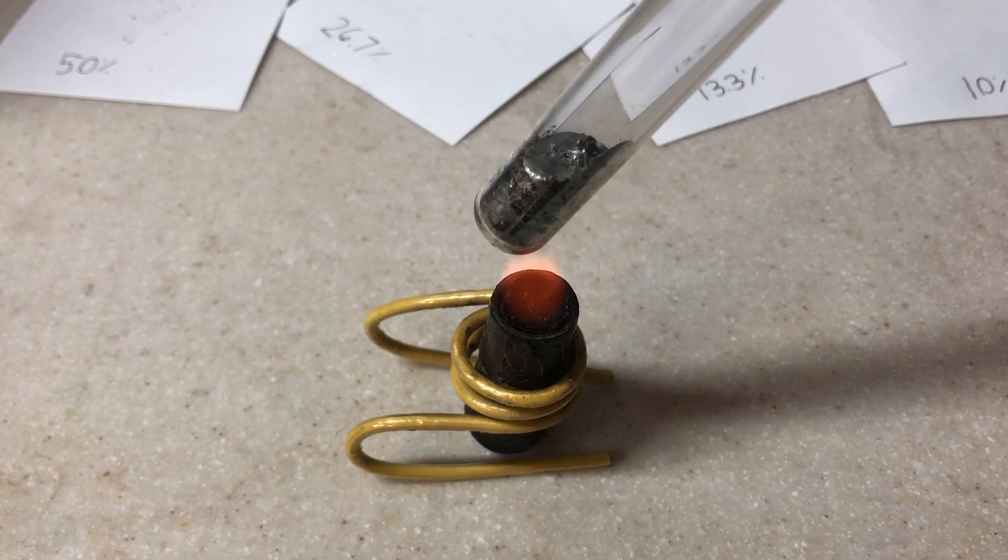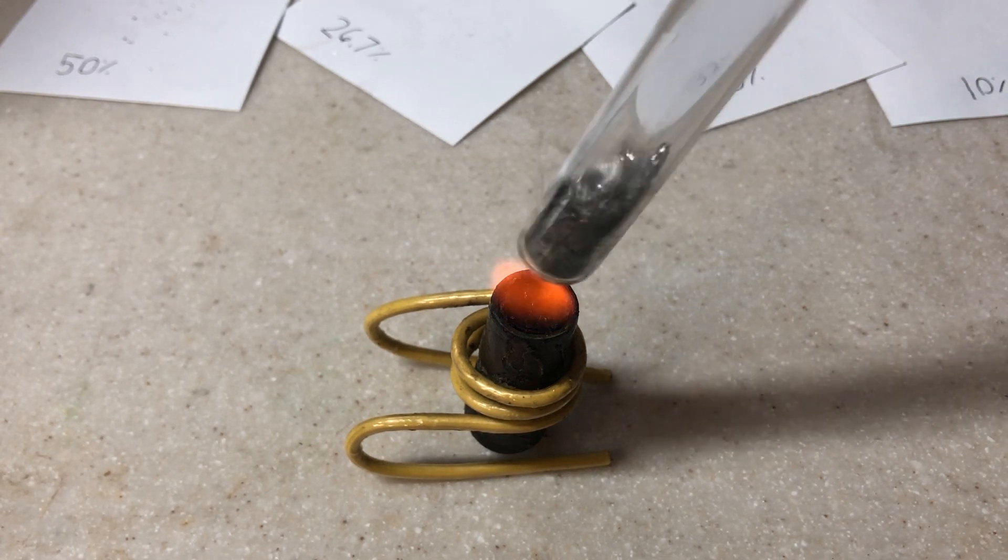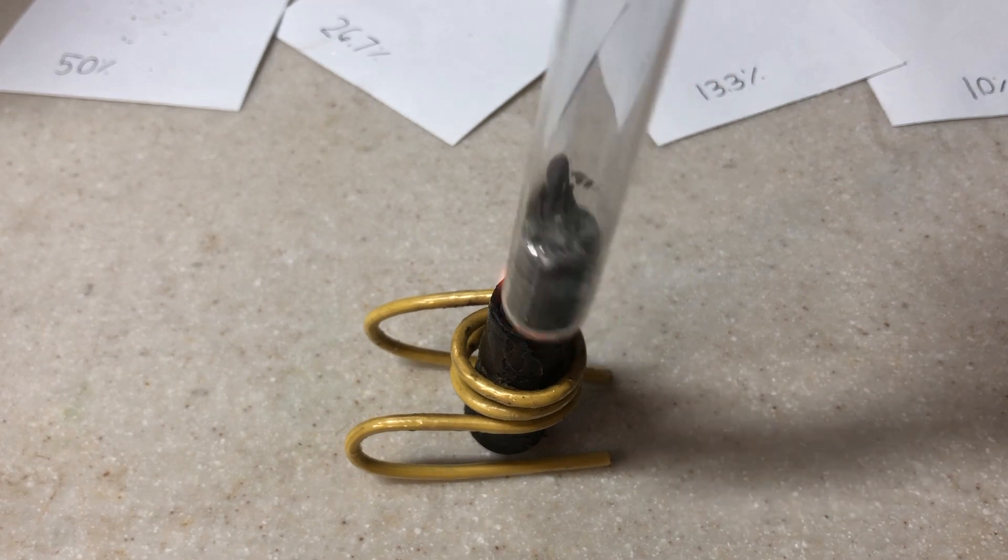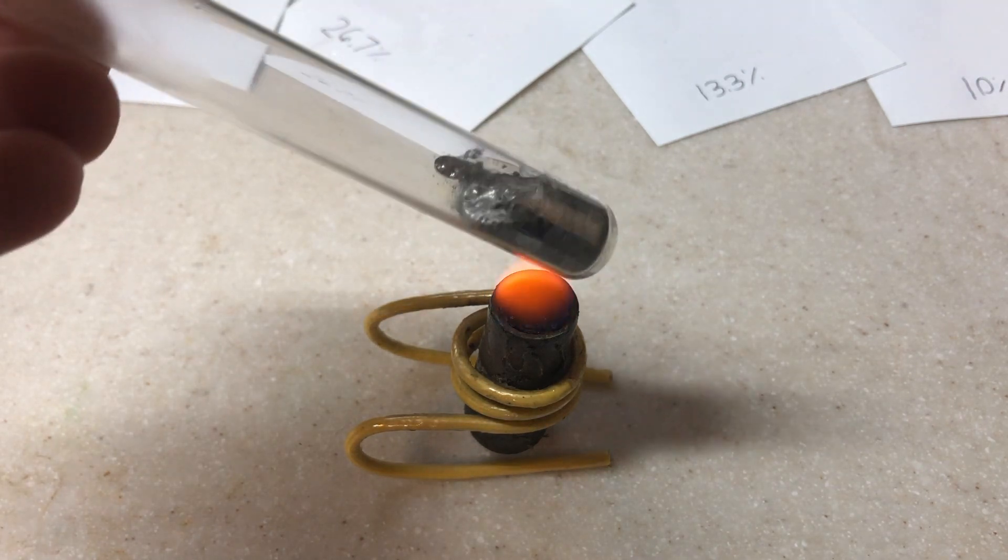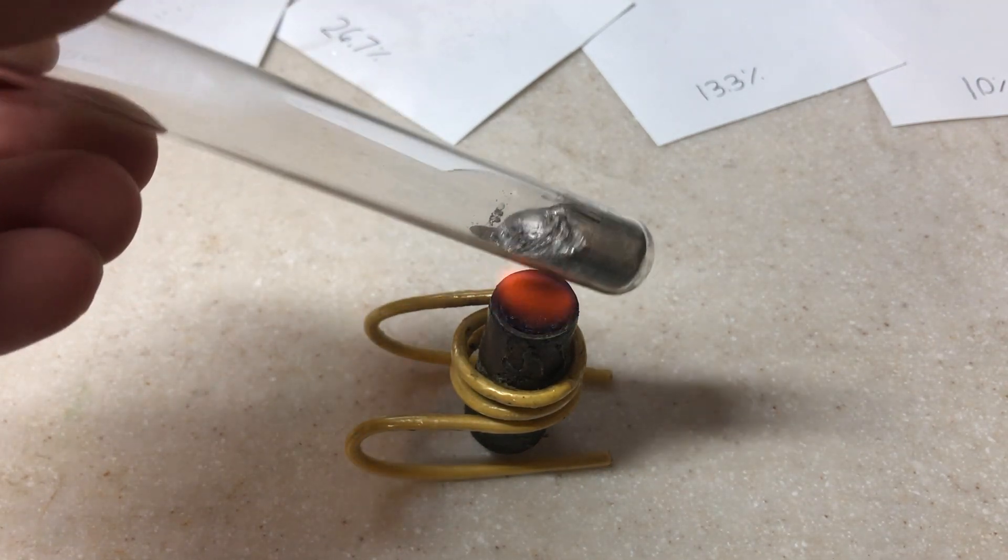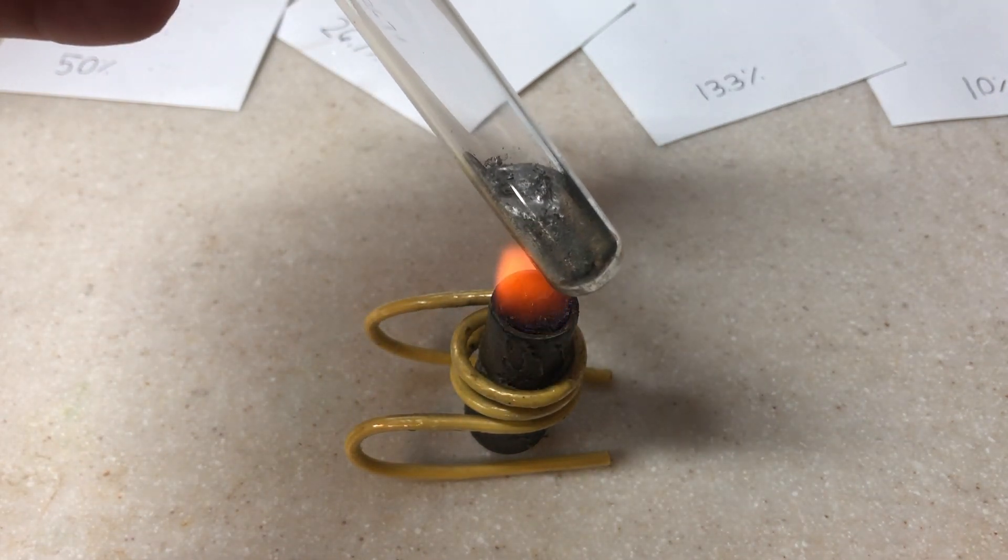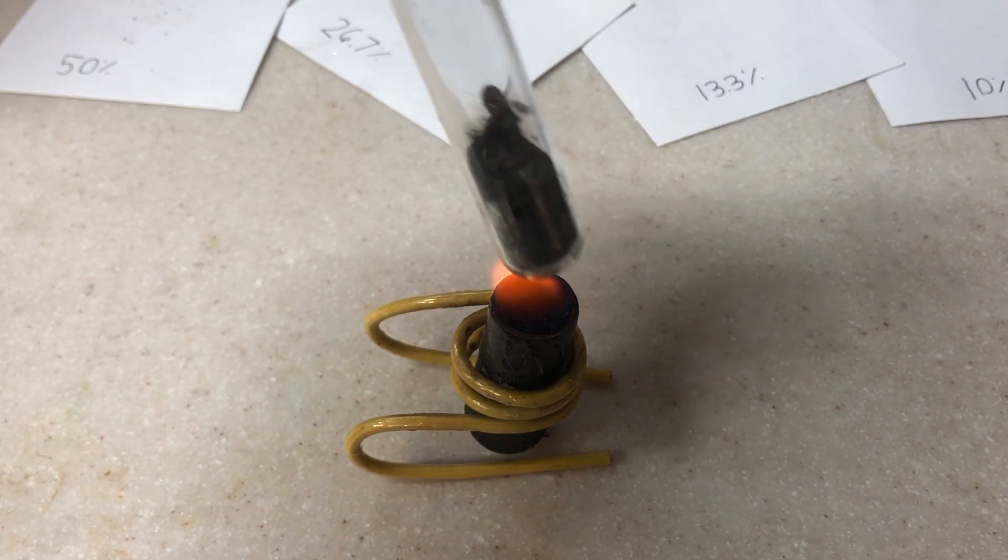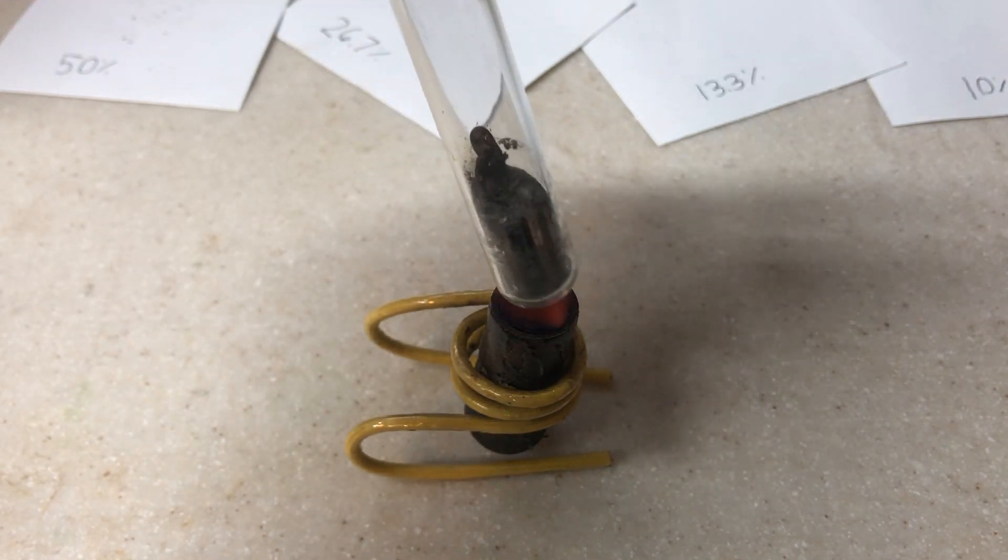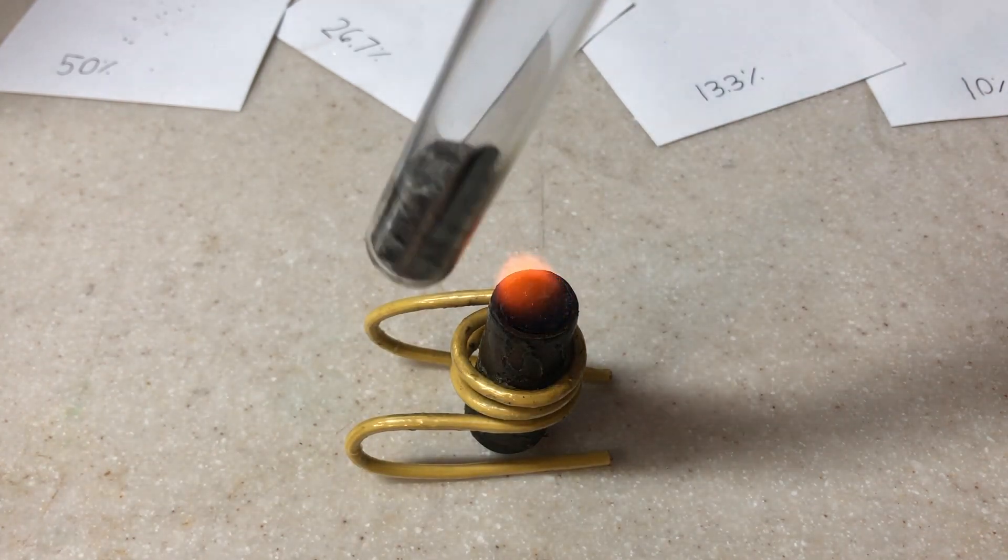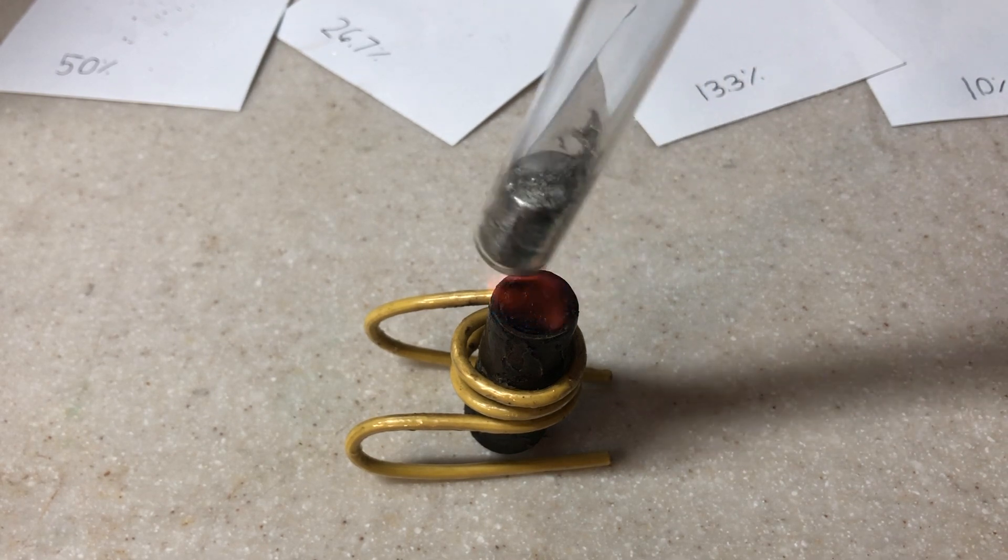It took the bismuth a while to melt because there was less surface area contacting the hot glass. And now all the metal has melted.